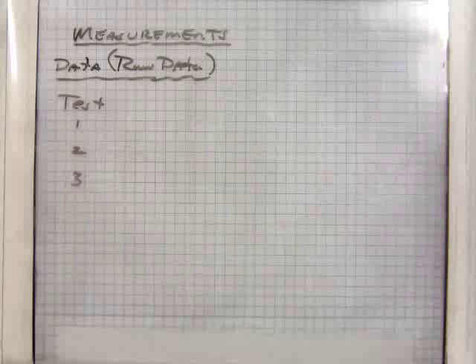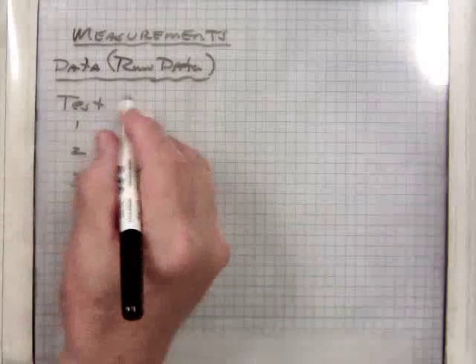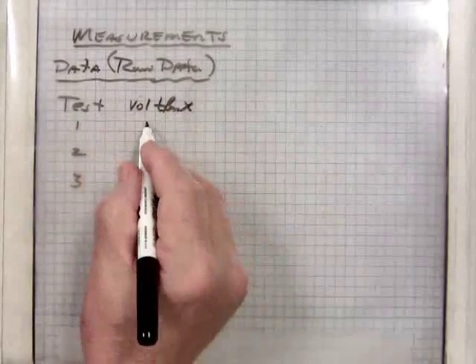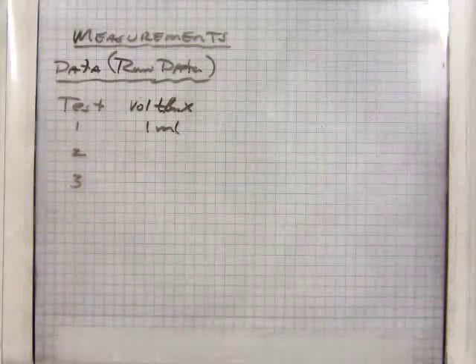Now I showed you that earlier in my previous class. And what did I do? I took a 2 ml sample, and I think I put the same volume in both of them. But I take 1 ml, 2 ml, 3 ml. I'm adding 3 different concentrations. So it's the volume of the T-butyl halide added. Well, simple enough. You'll squirt 1 milliliter into a given volume of IPA water. Remember?